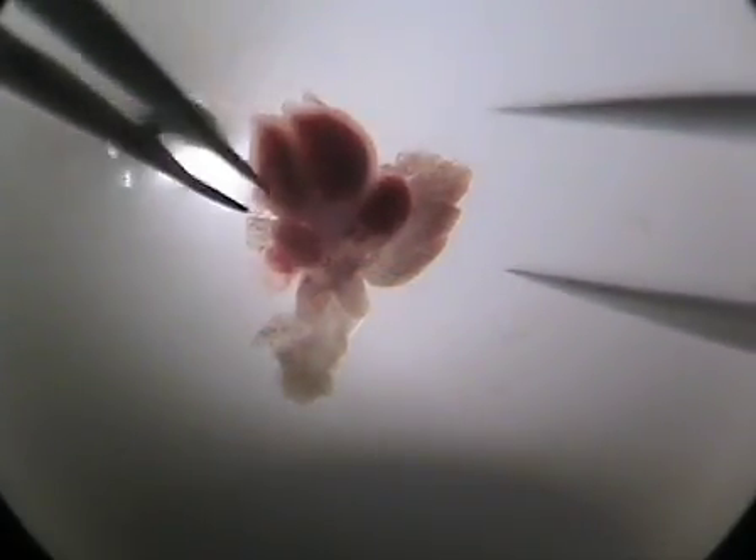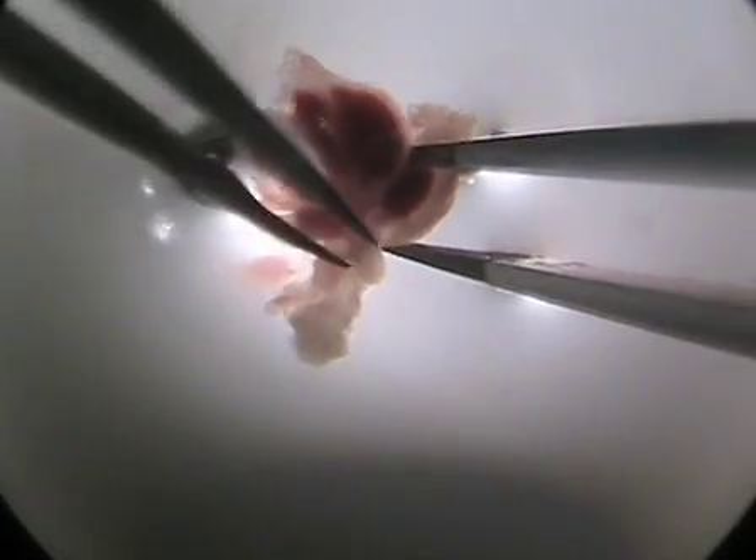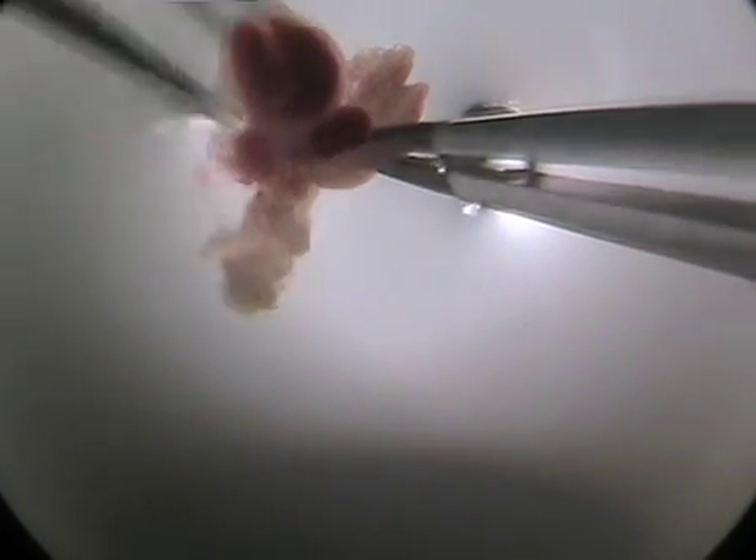In a day 14-15 embryo, the rudimentary thymus lobes are located just above the heart, on either side of the trachea. Remove individual thymus lobes using fine forceps, and also remove excess connective tissue and any adherent blood before proceeding to organ culture.